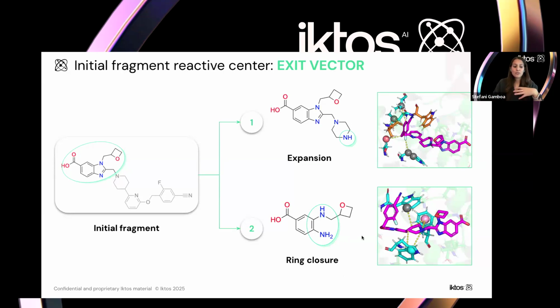To decide your initial fragment, you can use many tools, for example your chemical intuition, but in some cases it's a bit tricky to know exactly what initial fragment to use, like for this ring closure. So for that, we also offer another software, which is Spaya, which complements Makya by assessing the synthetic feasibility of molecules. Basically, it evaluates potential synthetic routes and helps identify suitable starting materials that are going to be used, for example, as starting points.